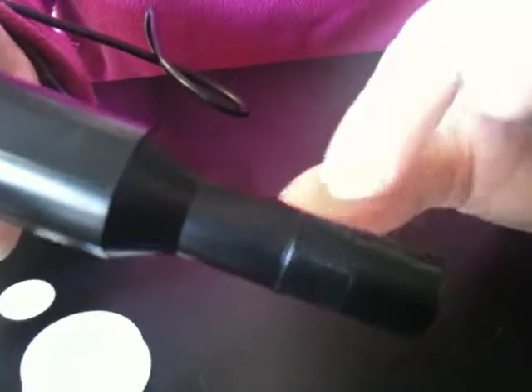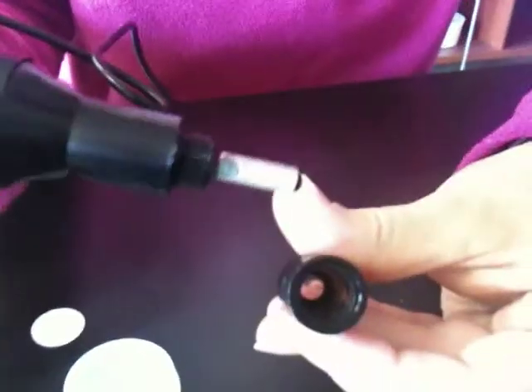Okay, so the first thing, if you need to replace the electrolyte, you'll probably either see some crusty salt buildup here, or if you haven't used the O2 meter in a while. To check that, if you've got the model where they have two parts of the cap, one with these little lines around, you want to grab the upper portion, twist this off, and what you're going to see is the steel end of the probe and the cap. Take a look inside the cap.